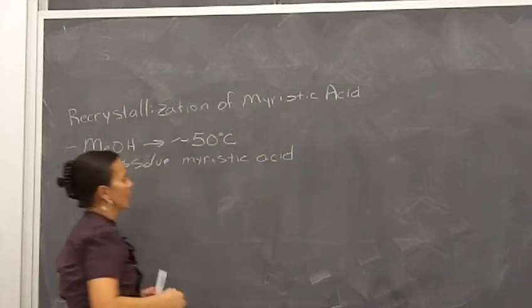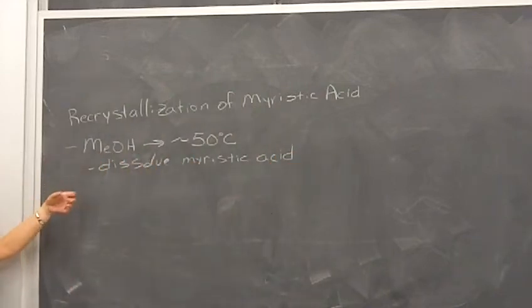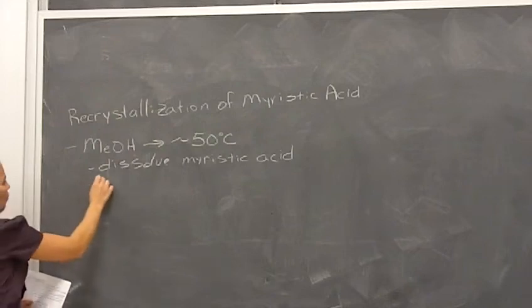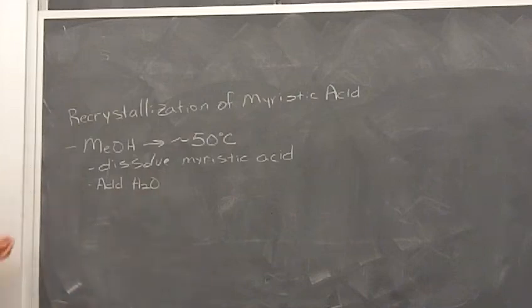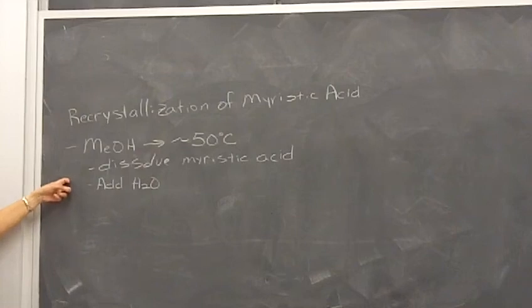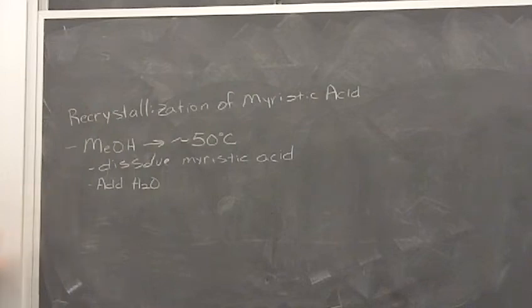Okay, and then you'll let it cool and then follow the instructions. You're going to also end up adding water to it, okay? It talks about potentially needing a hot filtration. When you get to the point you've dissolved your myristic acid, if you have any questions about hot filtration, talk to your lab prof before you do it yourself, okay? Because this one can kind of be messy if you try and do it and don't keep it hot. You've got that slimy myristic acid kind of crashing out everywhere, okay? So if you think you need a hot filtration, talk to your lab prof before you do it, all right?